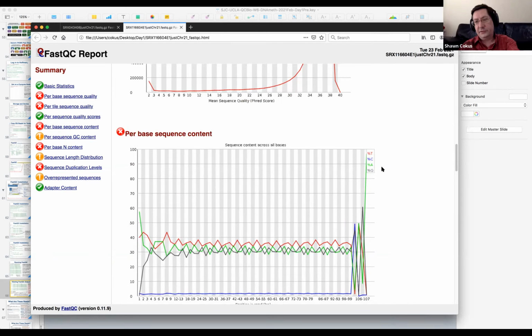So yeah, there's two things fighting, right? Which is to have uniform, high quality, and ideally the same length for everybody. Because remember, the longer they are, the more of the genome is bisulfite unique, alignable, and less of it isn't. So if you want all libraries to have access to the same sites, then the lengths have to be comparable. So ideally, we would pass a high quality common length subset for everybody. But working in the other direction is that every cut we do, your coverage goes down.